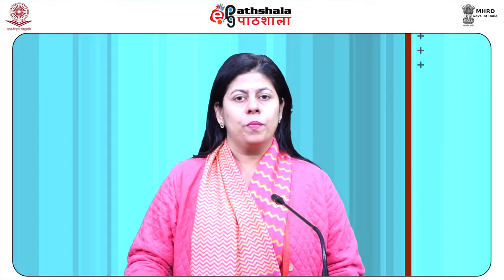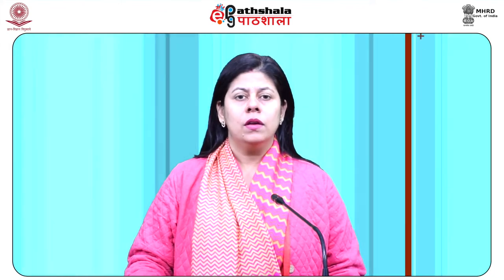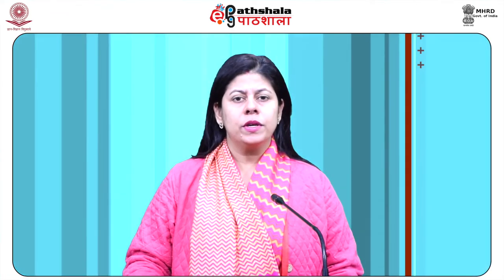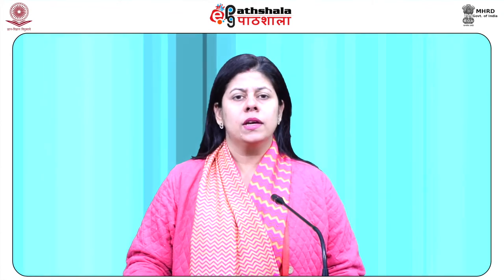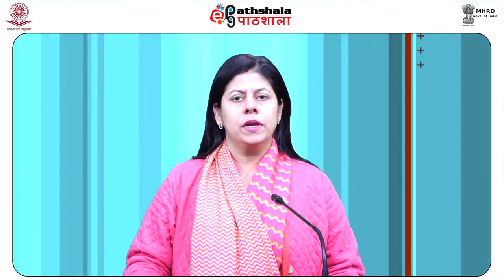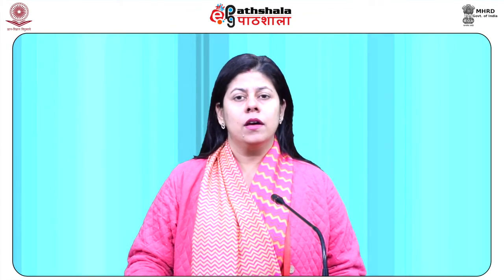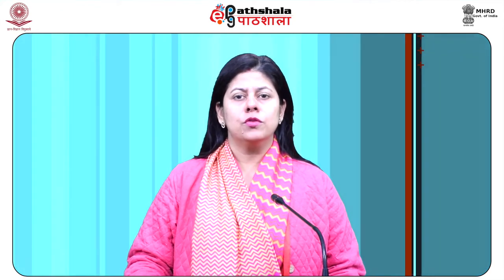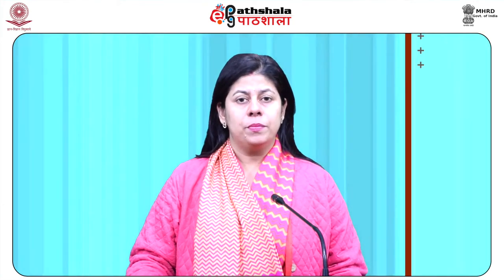The word microscope is derived from the Greek words micros, which means small, and scopion, which means to look at. The science of exploring small objects using such an apparatus is known as microscopy. A microscope is defined as an optical apparatus that uses an arrangement of lenses to yield an enlarged image of small objects.